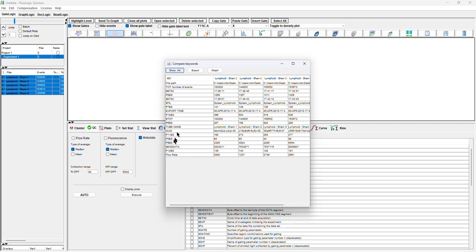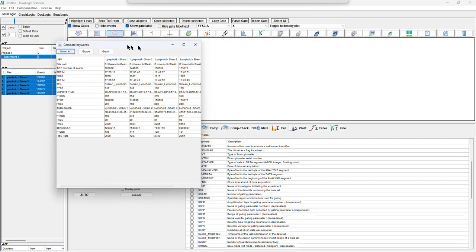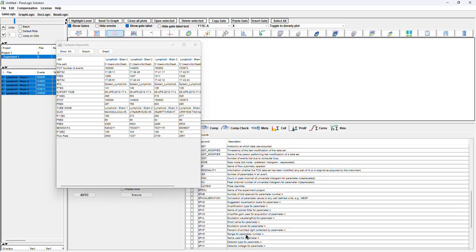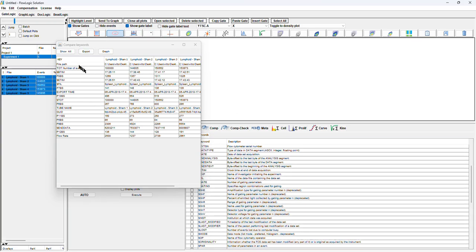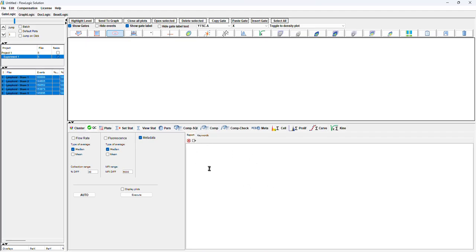and if you don't see any sensible keyword like the keywords that you have here, telling you that you have the amplifier gain, voltage, so if you don't come with anything, there is no difference. If it's coming with something, please do an evaluation of the keyword. And if you think that the files are okay, close. Here is the reporting area.